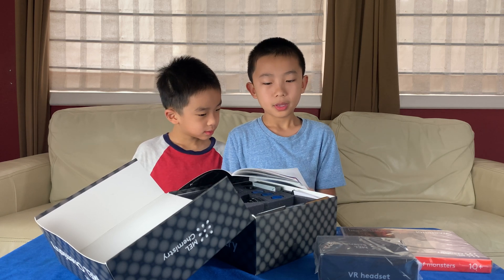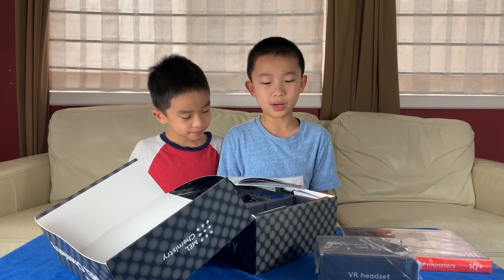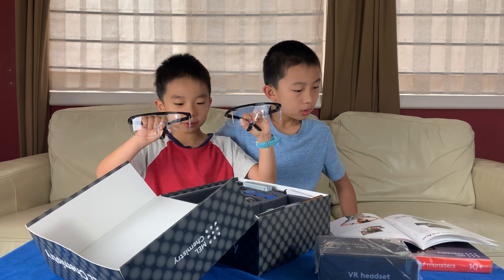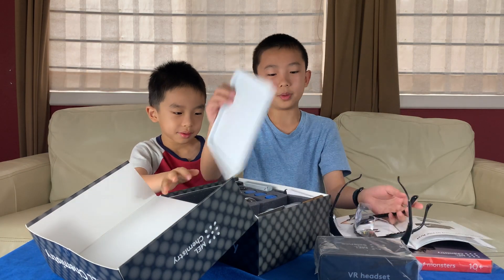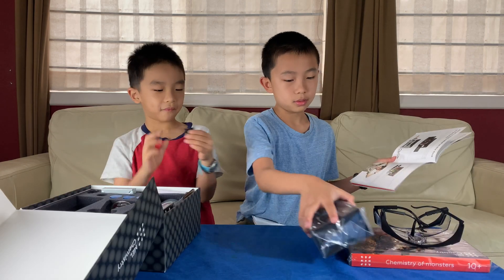They also have an app which will take a closer look at the molecules we're working with. Now I'm going to see what's in the rest of this box. So here are the two safety glasses. And here's the plastic tray. This is where we'll be doing our experiments - in the plastic tray.